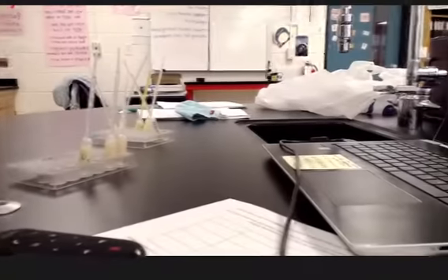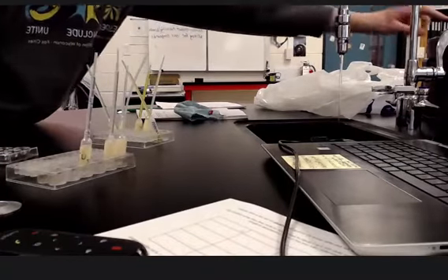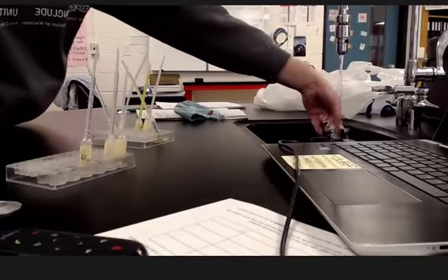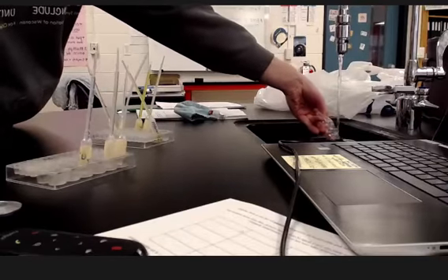Remember, when you wash out a spot plate, right, water on first, and then you put your spot plate in at an angle so you don't make a giant mess. Okay, because a spot plate is like a whole bunch of spoons and it makes a giant mess.